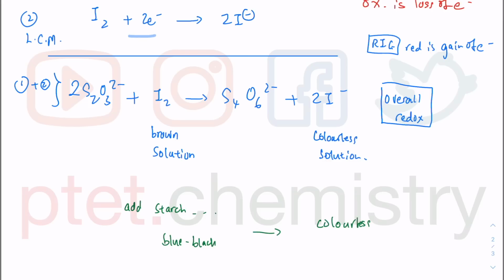So you get colorless solutions when all the iodine is no longer present, and you get that with one extra drop, very, very sharp. So it's quite impossible that you overshoot unless you did not do it drop by drop at the end of the titration there. Okay, of course, one rough and two exact titrations.